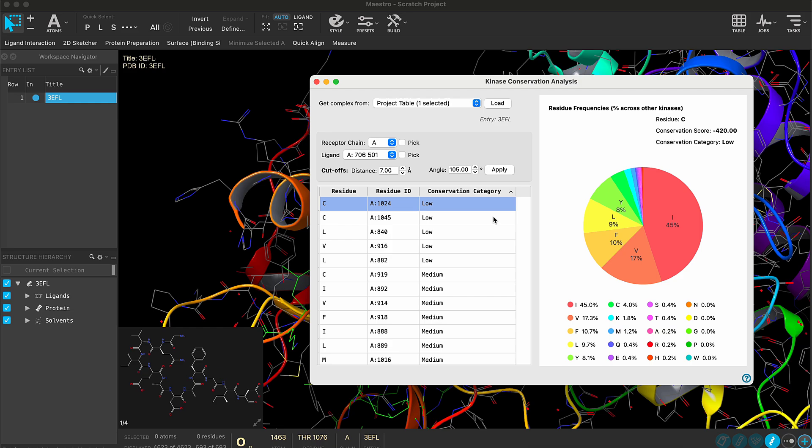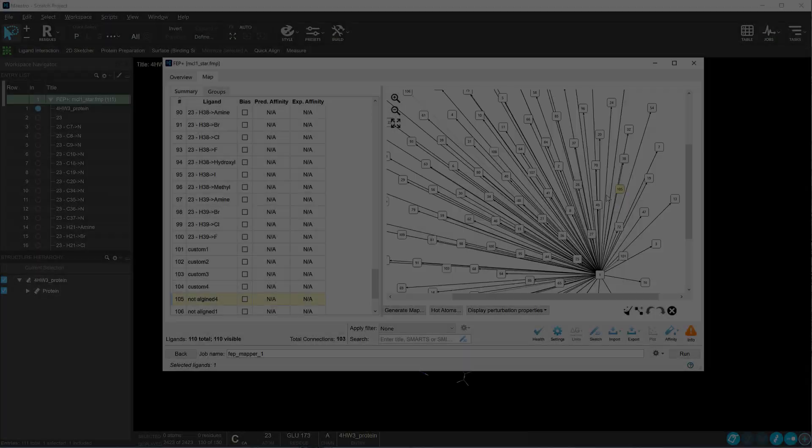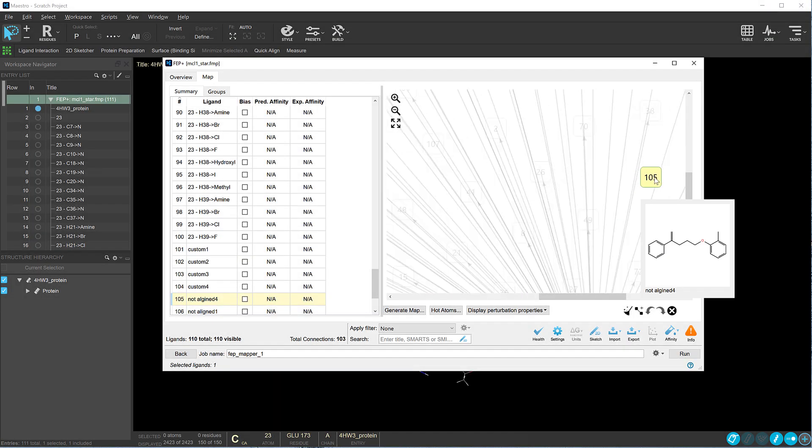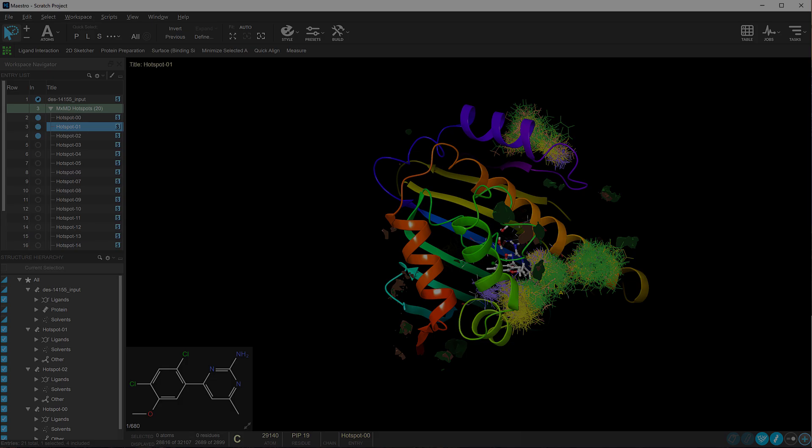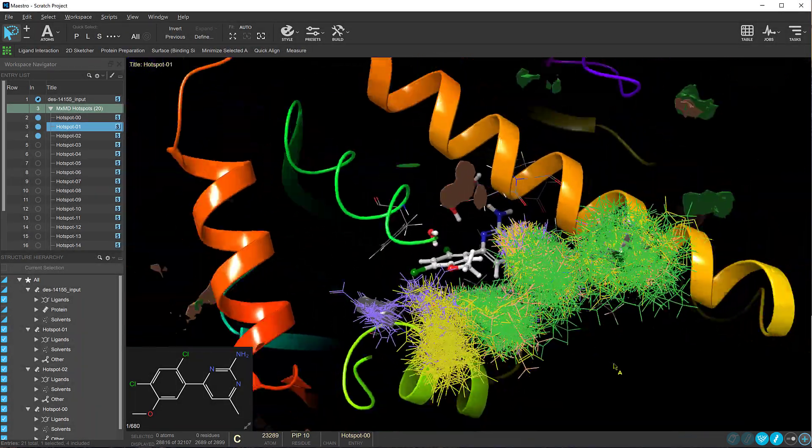Welcome to the 2025-1 Schrodinger release. Let's take a quick tour through the suite's latest innovations and improvements.